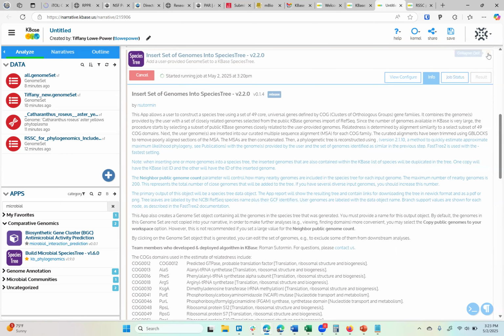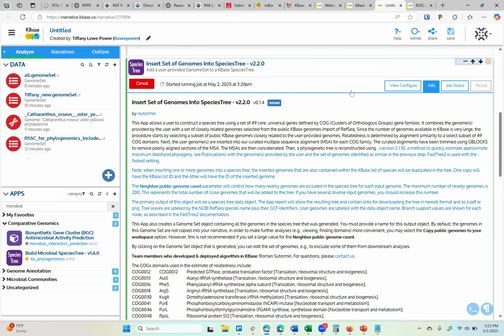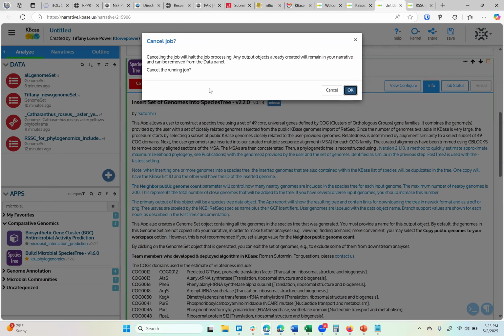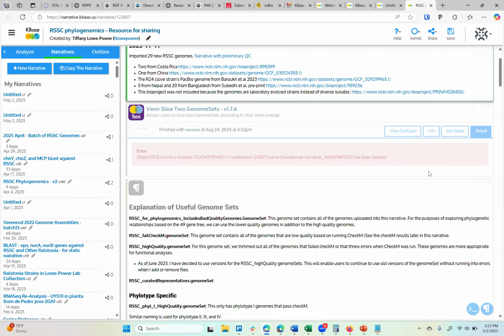Okay, so I'm not going to keep running this. Well, it will keep running, but I'll actually cancel it because I'm not going to use this and I don't need to waste their computing power. Once it is successfully done, you will be able to download it.